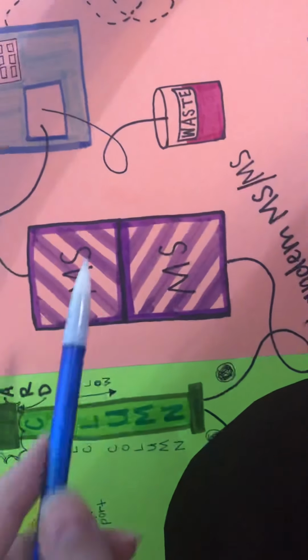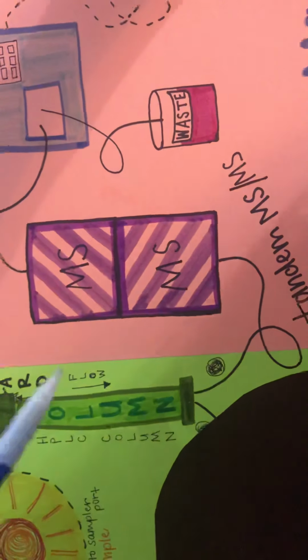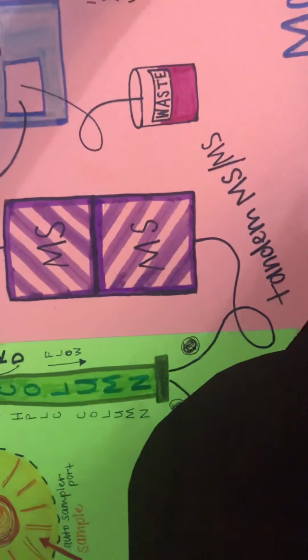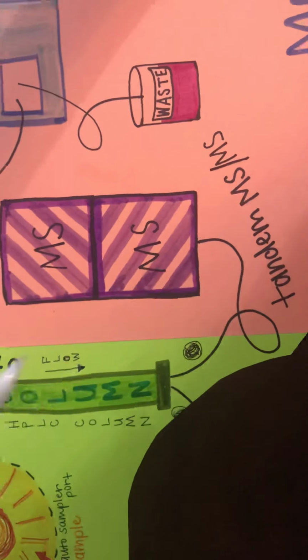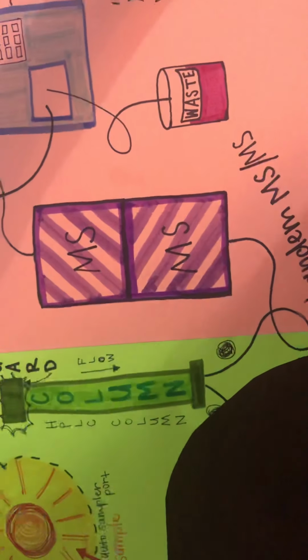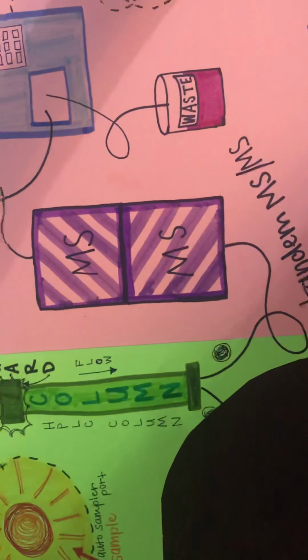A quick note about mass specs is that the MS equipment is very expensive and difficult to maintain. An example of just how expensive it is: the turbomolecular pumps within it cost $10,000 to maintain. So you can imagine how expensive the whole thing is when a little pump is just $10,000.